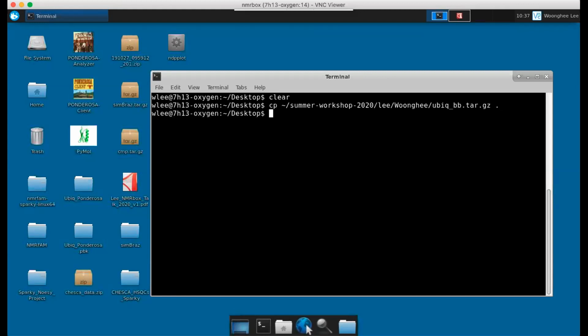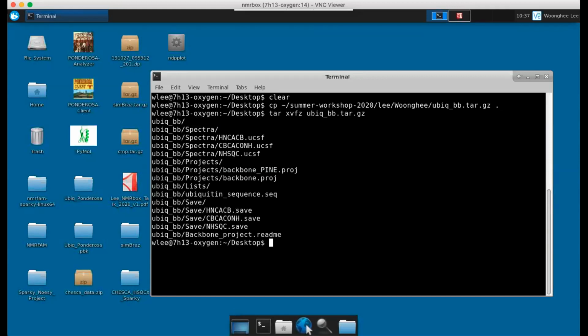And I will untar the file that generates ubiq_bb/ and the files that you will see. And also all credits should go to NMRFAM's Marco Tonelli, who collected the data and processed the data. This is the data that we typically use for our workshop.